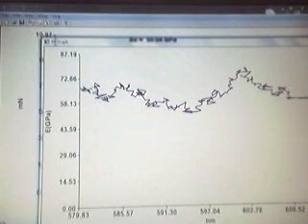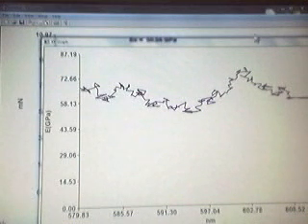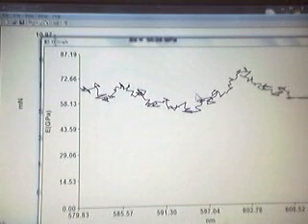You can see how the elastic modulus varies along the unloading curve. And as you can see, around 602 nanometers, there seems to be a large elastic modulus, whereas at another portion, at around 591 nanometers, there's a lower elastic modulus.